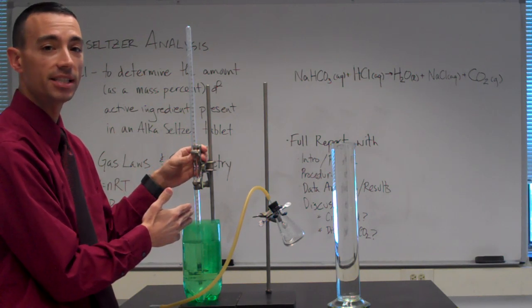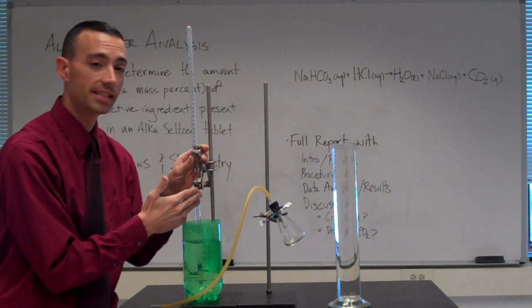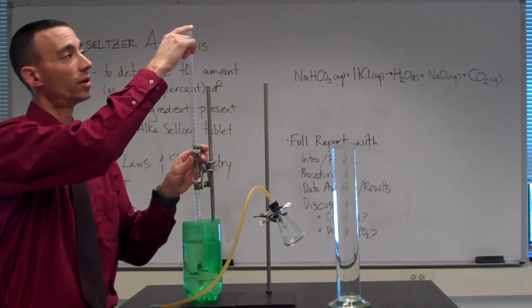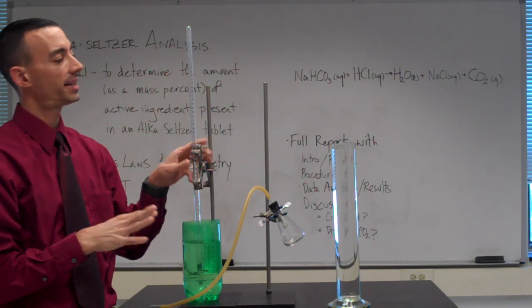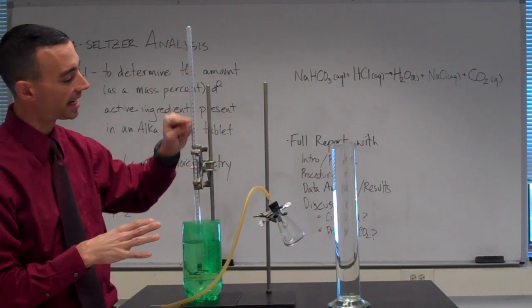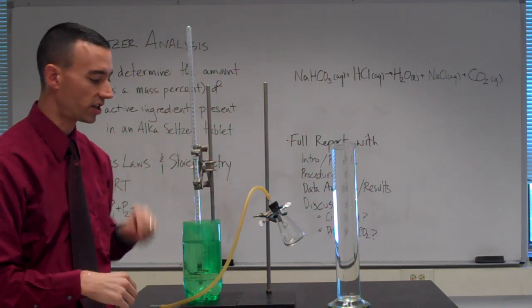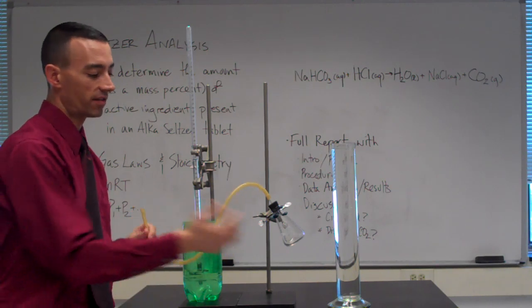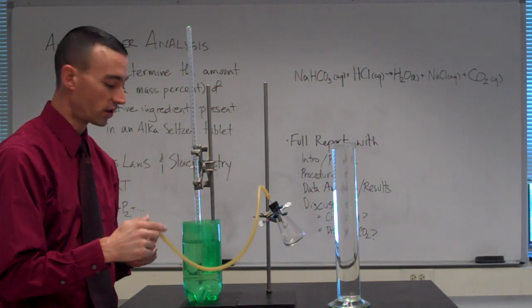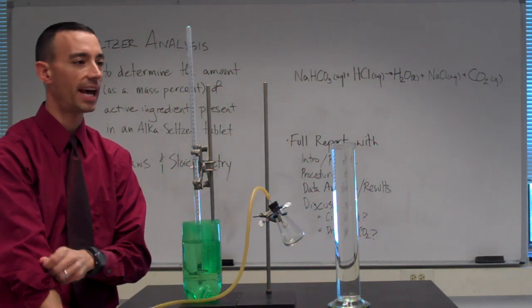It really is very similar to the buret that you would use in an acid-base titration, except that there's no stopcock at the bottom end. It's simply closed off. Make sure you pay attention. 0 is the closed end, and it reads downward from there, since you would use this in its inverted fashion. To get the gas out of the chamber into the tube, we use this little transfer tube, and so you're going to have to get your hands wet as part of today's lab.